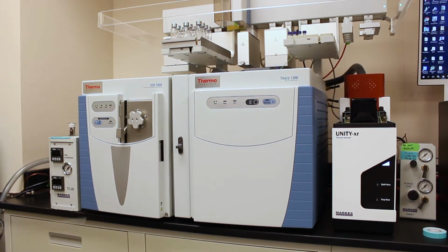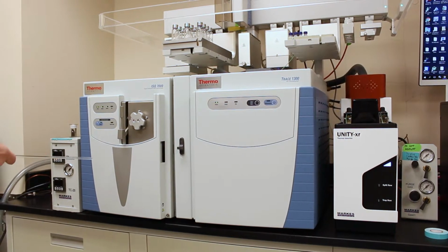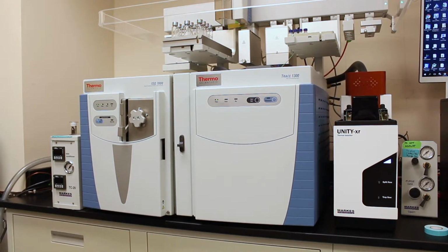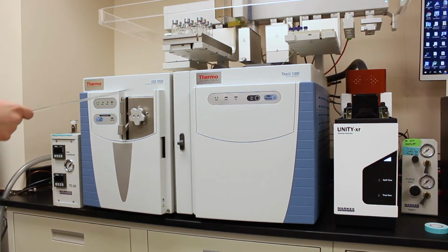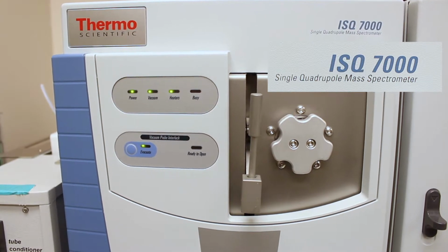So here on the left, I know this is a very complex instrument, which we'll talk about, but this box right here, this enclosure, is what a mass spectrometer can look like. So it's not very interesting superficially, it's just a box. And if you can see here, it says single quadrupole mass spectrometer. So that's how you know it's the mass spectrometer.